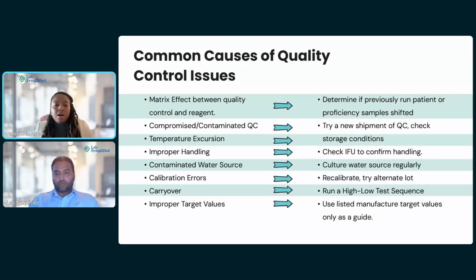There are certain freezers that automatically defrost, auto-defrost freezers. So if that's something that you have, you just want to make sure that it doesn't cause your products to thaw and then rethaw and go through these freeze-thaw cycles, causing issues with your products.